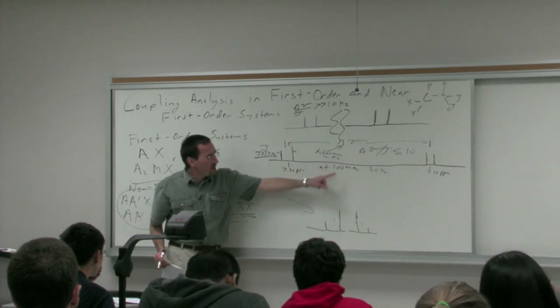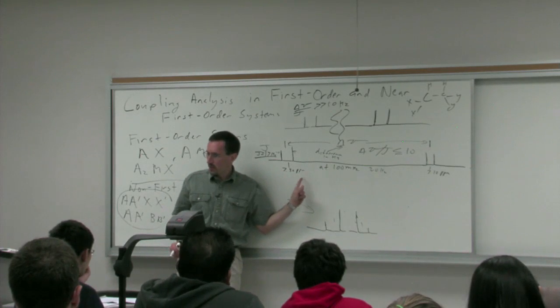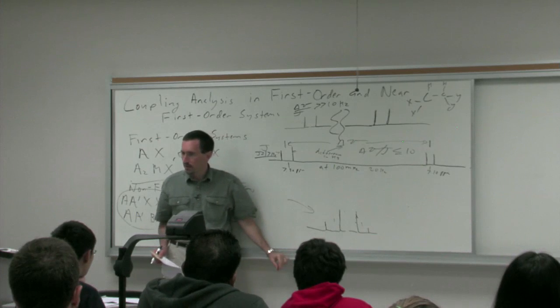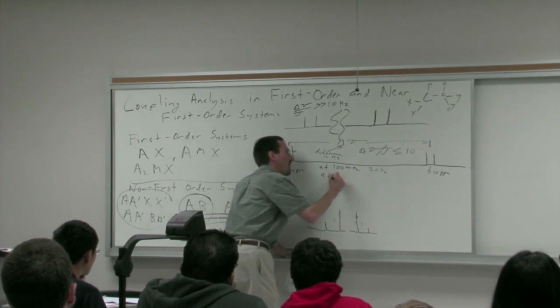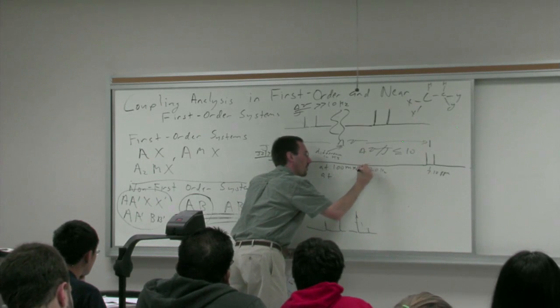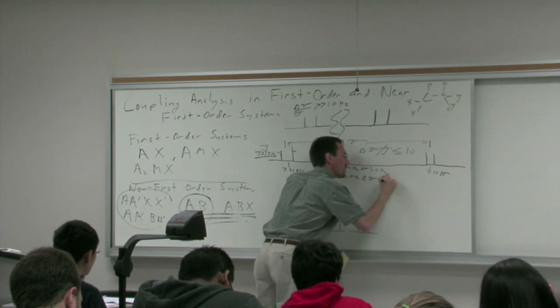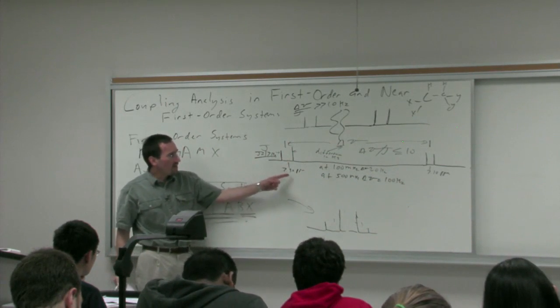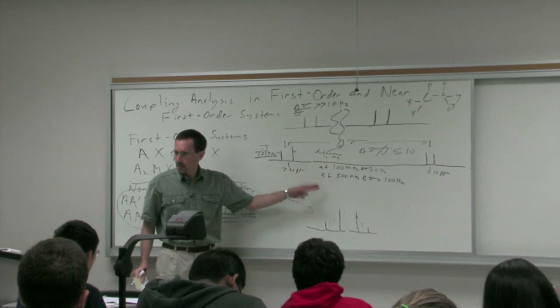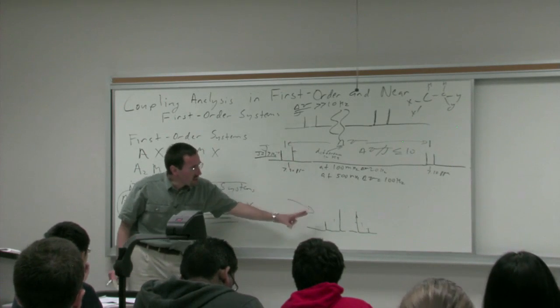If we had the same system at 500 megahertz, what would delta nu be? A 100 hertz, right? So at 500 megahertz, delta nu is equal to 100 hertz. And so you look at this situation, and at 500 megahertz you'd be more like this. At 100 megahertz, you'd be more like this. And so this is your AB pattern.